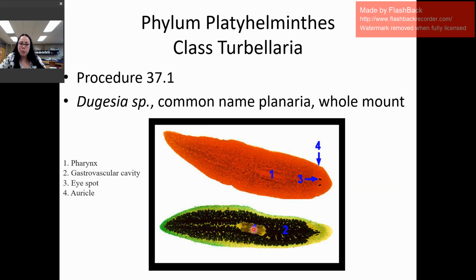And then in the middle, number 1, which we also distinguish on the picture above, is the pharynx. So the pharynx, like I said, is in the middle of the body. It can come in and out. The extremity of the pharynx is used as the mouth, and so they use that for feeding. The little number 3 shows the 2 eye spots that they use to detect light.